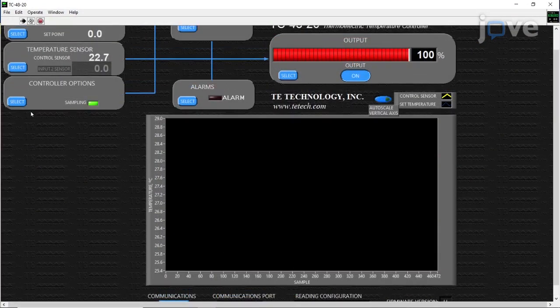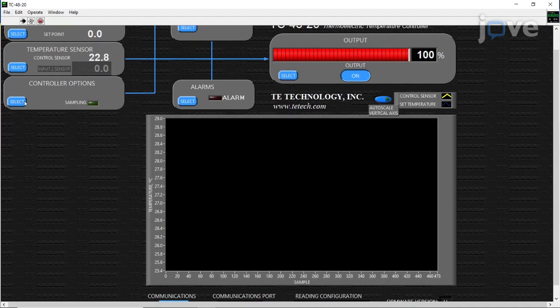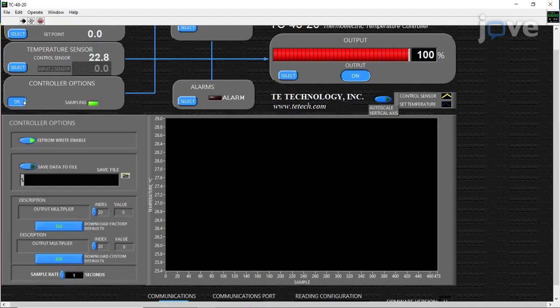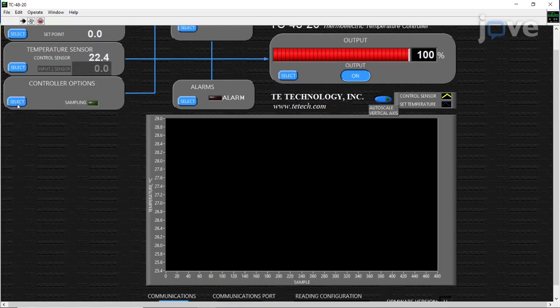When the thermostore is flashing frequent interval measurements, change the interval time to 60 seconds. In the controller options box towards the bottom, delete 1 second and change to 60 seconds, then click on the OK button.